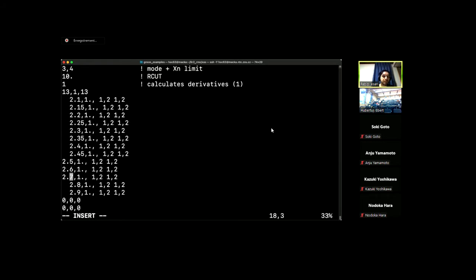Then the second column, if you remember, is the degeneracy. In this case, we want to calculate only for one type of atom, because the degeneracy is already inside the RMC, because we have a given number of atoms. In this case it's only a two-atom system, but even if you have more atoms, when you calculate the signal, you just calculate for a degeneracy of 1.